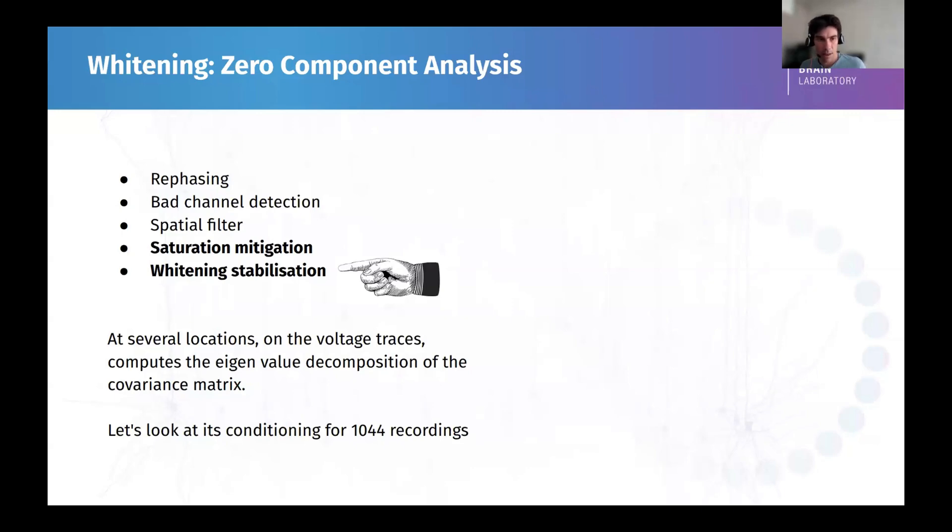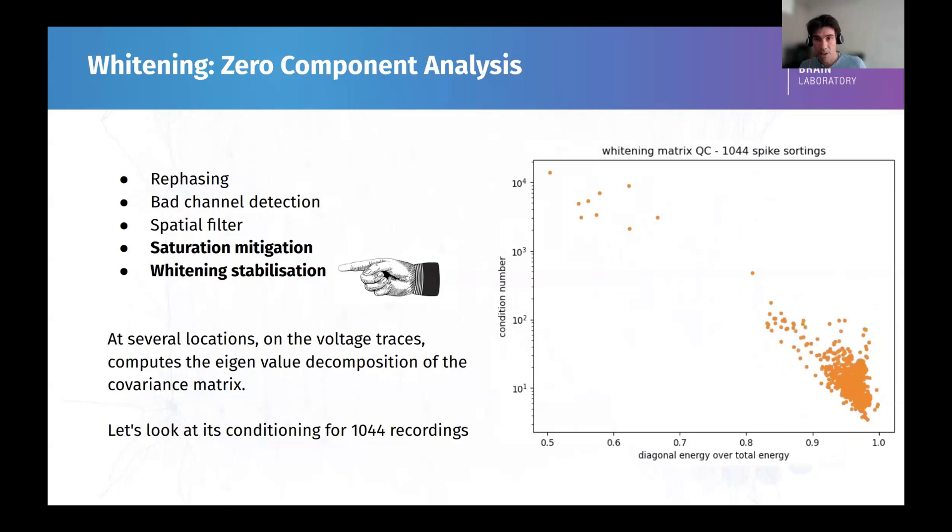The impact of the whitening is that we compute a covariance matrix of the data. We try to estimate this covariance matrix, and then we inverse this covariance matrix so as to decorrelate the channels. What happens is that if we start looking at the conditioning number of this matrix with the stability or how much energy, if you will, is on the diagonal, we can see that most of the recordings stick at a very low condition number here on the single digits. But we have some recordings that are very high up, and those recordings exhibit a very wrong spike sorting.